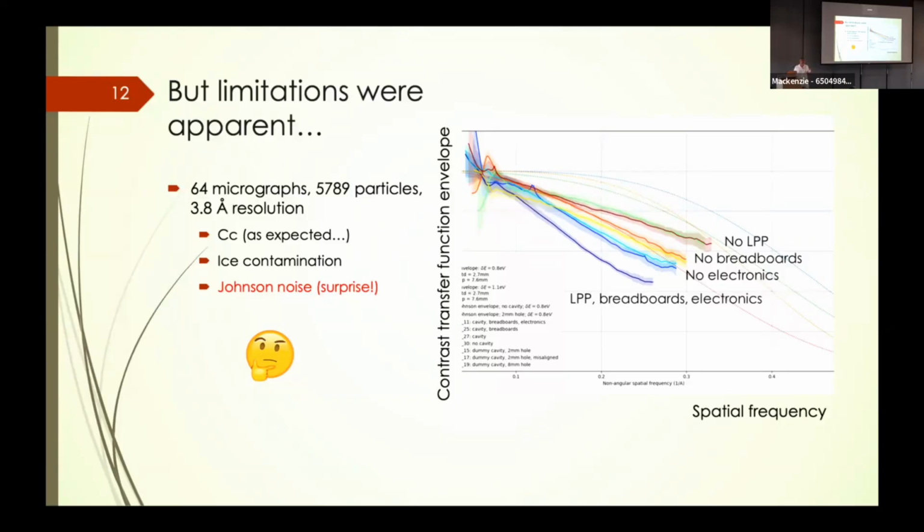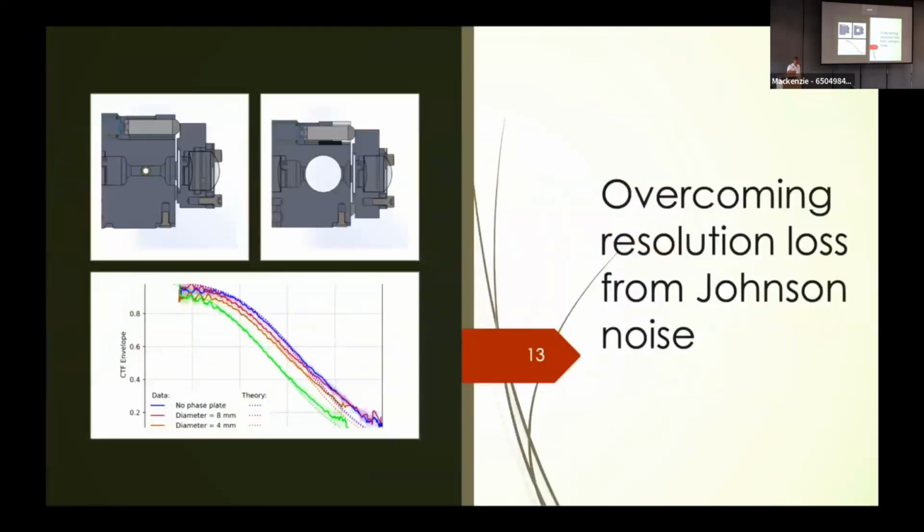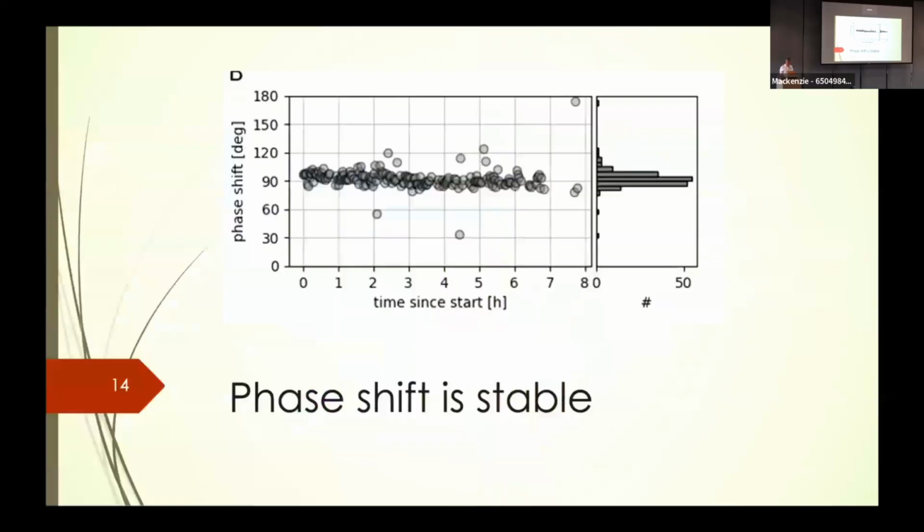Well, whenever an electron beam passes close to a conductor, it is subject to fluctuating magnetic fields generated by thermal electron motion inside those conductors. In simple words, the electron beam was too close to the wall, and the wall is a dirty thermal system that generates fluctuating magnetic fields. The solution to that was to increase the diameter of the hole that the electron beam has to pass as it makes it through the faceplate. And with that, we were able to get the performance up so much that it is almost indistinguishable from the theoretical limit for that microscope. So that was a success.